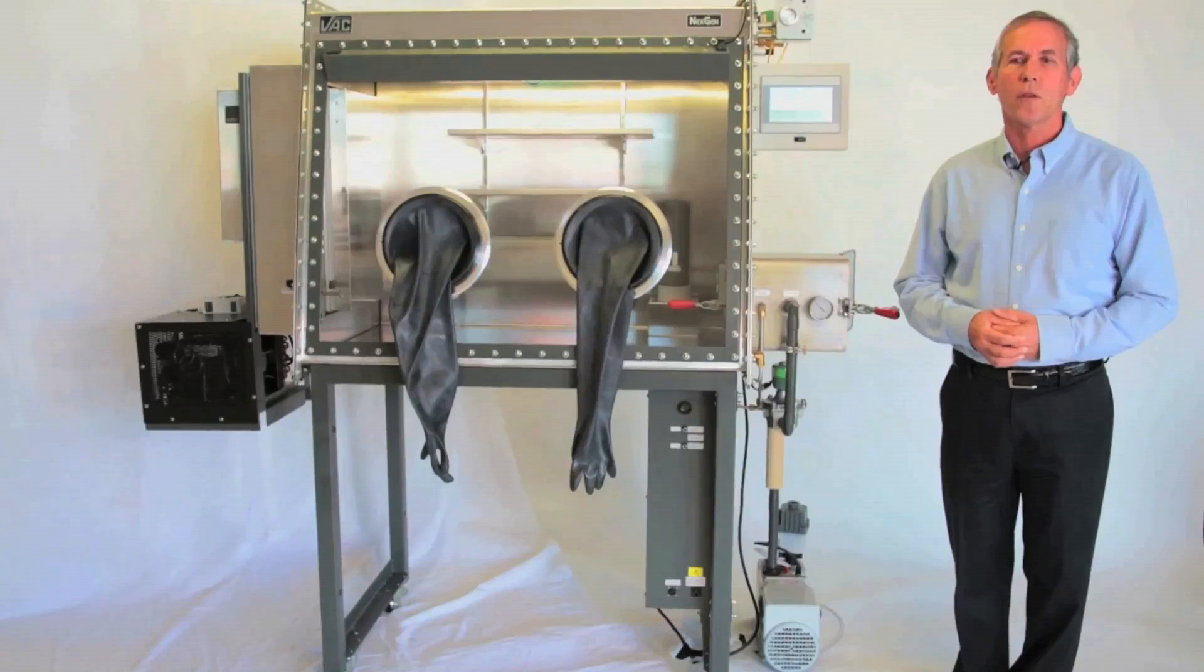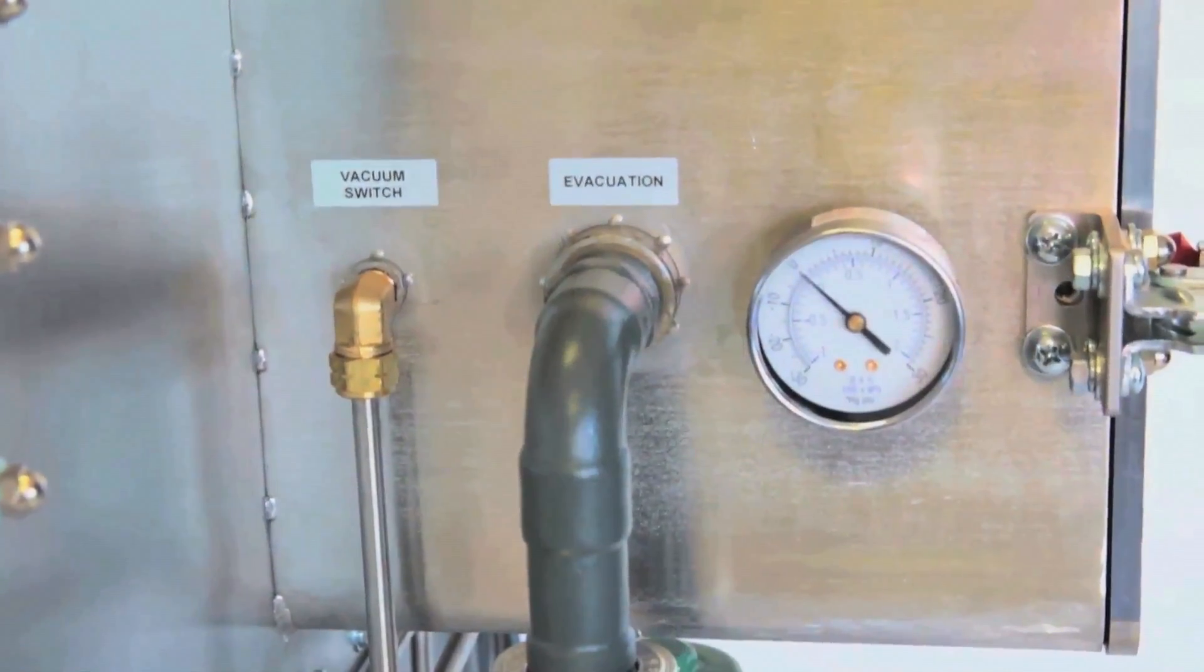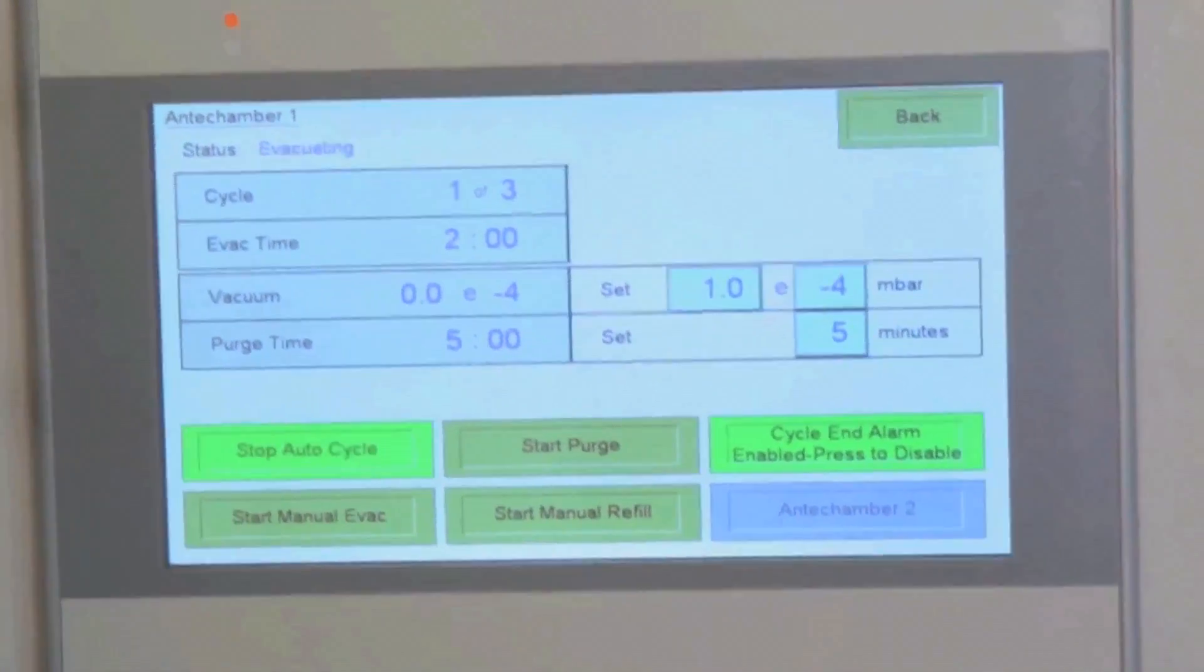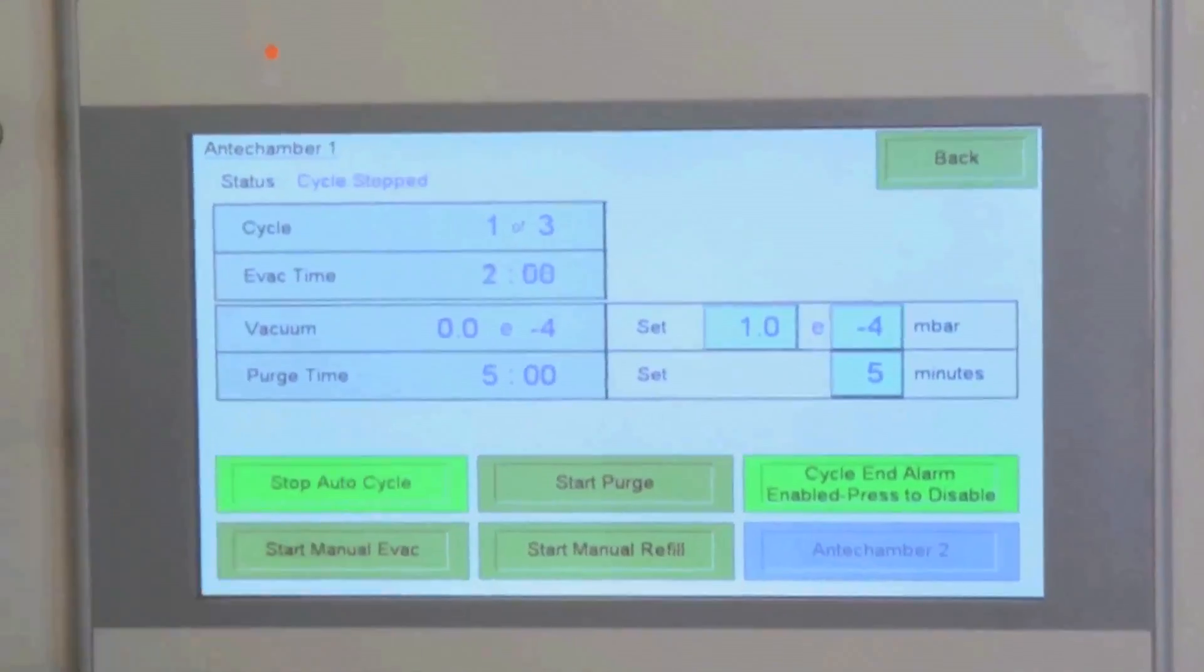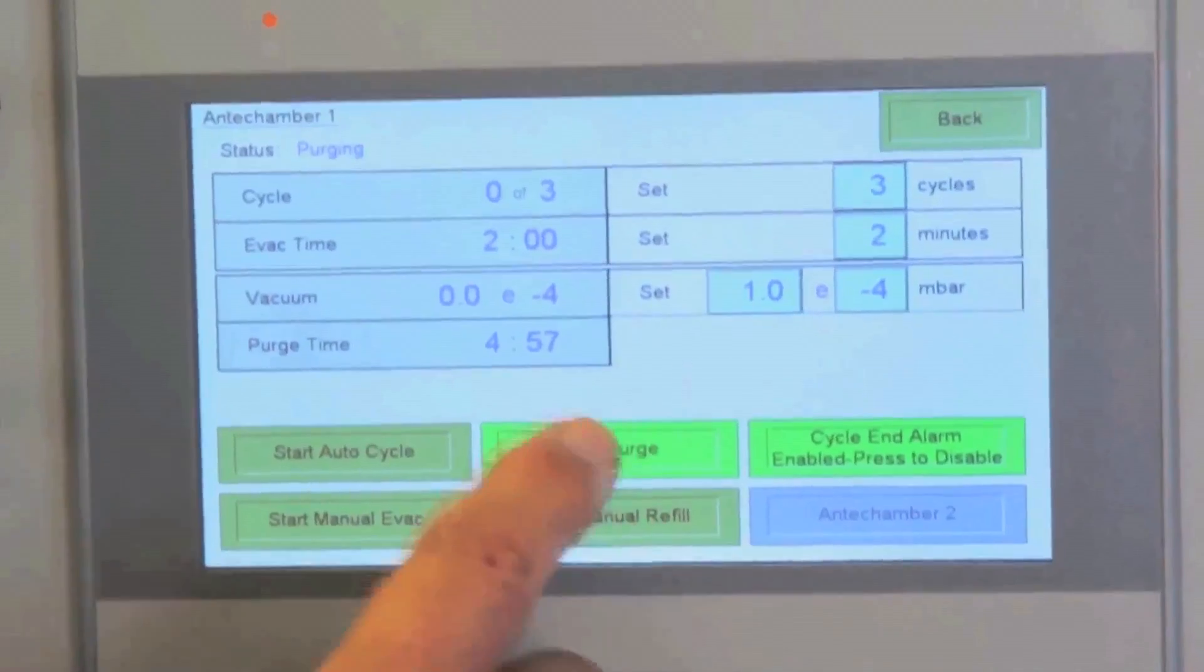For moving material into or out of the glove box, the anti-chamber may be operated manually or with optional automatic functions. The automatic functions include timed automatic evacuation and refill, pressure-based evacuation and refill, and timed purge.